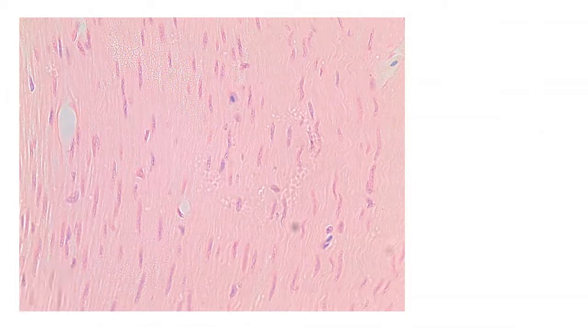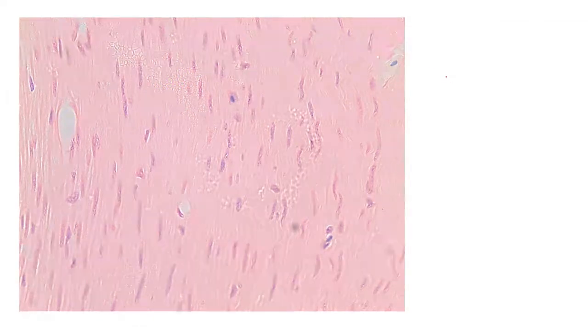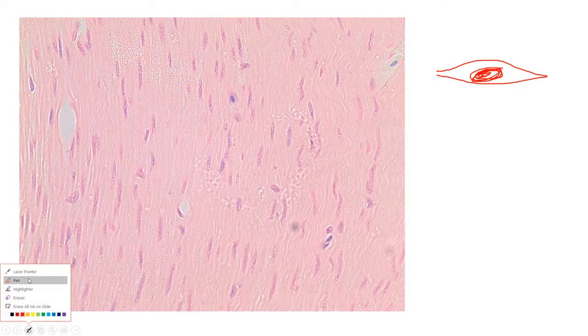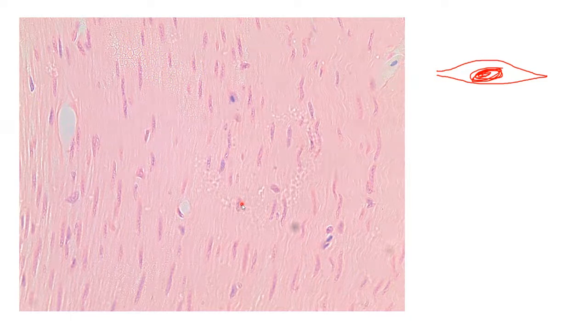When we're looking at muscle tissue in particular, in our lab after the midterm, we'll look at how the shape of smooth muscle cells is like this. We call it fusiform. So you're seeing our dark purple spots in the picture. Those are the nuclei that are inside these cells that are squeezed flat together. So lots of cells with very big nuclei. This is smooth muscle tissue.